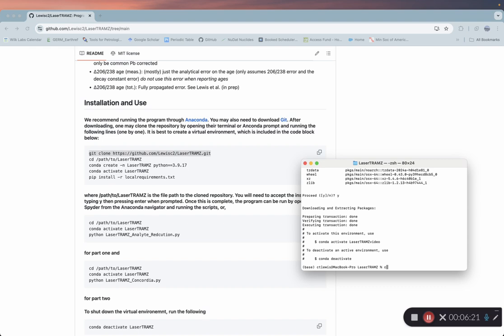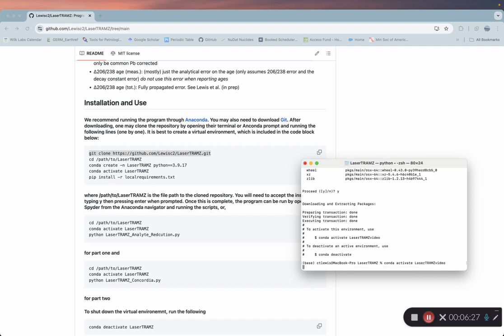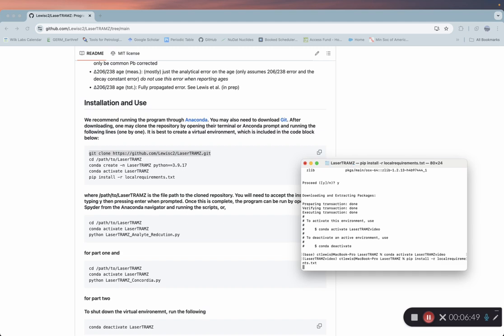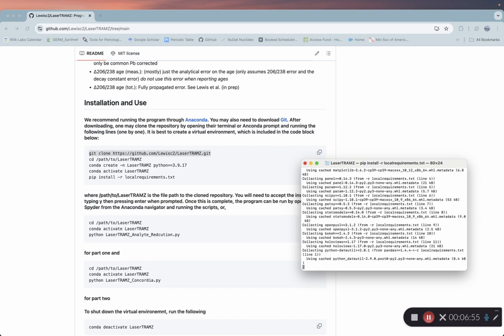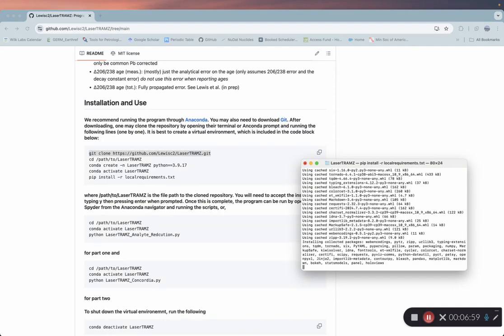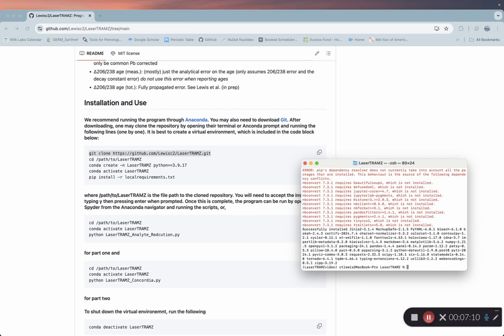Now we're going to activate that virtual environment. We're going to say conda activate LaserTramZ. Now we're going to pip install dash r local requirements dot text. This is one of those files you cloned off the GitHub page. It specifies versions of packages and libraries that we want to install in this virtual environment. Go ahead and type that and press enter.